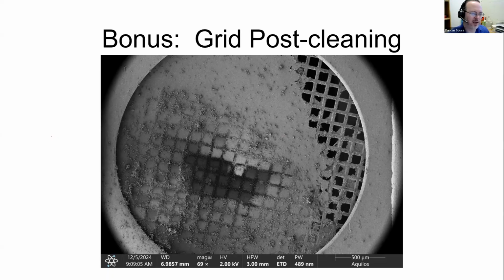But can you remind me what the first question was again? Yeah, the first question is regarding service for lamella lift out. So practically, what are the yield rate and the throughput, and if at the end you couldn't get it, it's one day of work. So how do you charge people as a facility?